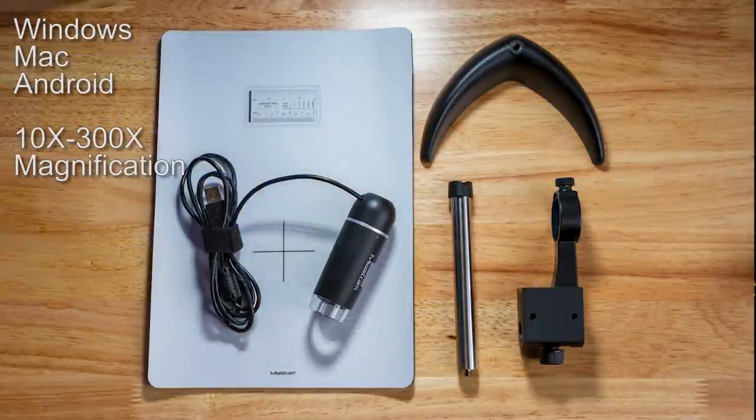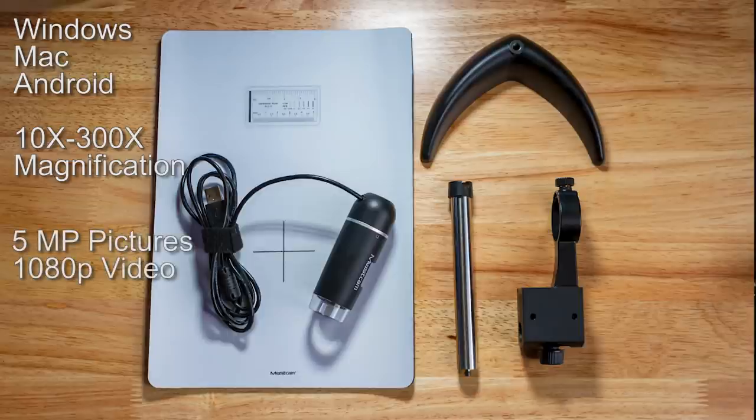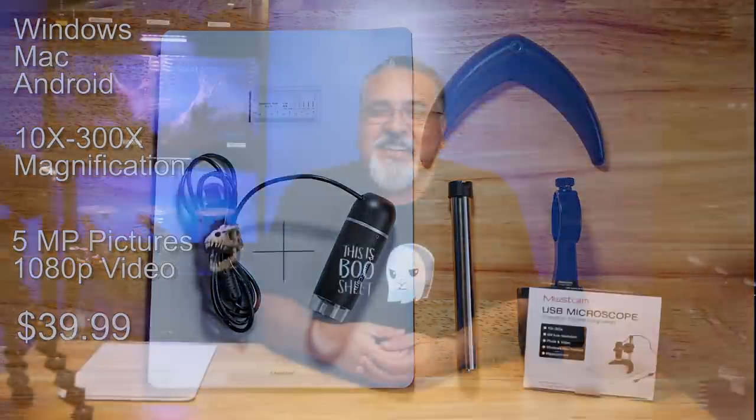These microscopes can be hooked up to your computer or your cell phone via a USB cable and can be powerful enough to see small details necessary to determine the gender of some of your smallest tarantulas. The one I purchased from Amazon is a Must-Cam USB microscope. It hooks up to Windows, Mac, and Android devices and has 10-300x magnification. With the included software, I can take pictures of what I'm viewing and even record 1080p video. I paid about $40 for it. This is not a paid advertisement nor am I endorsing this product. If you search on Amazon, you can find several different USB microscopes at different magnifications and prices. My suggestion would be to look at the reviews and see which one is best for you.